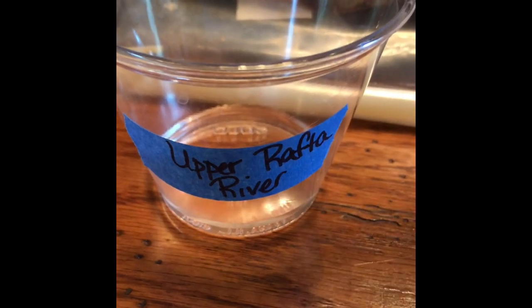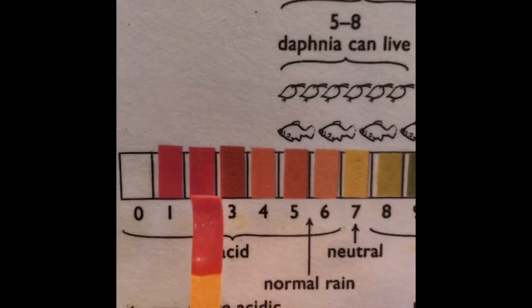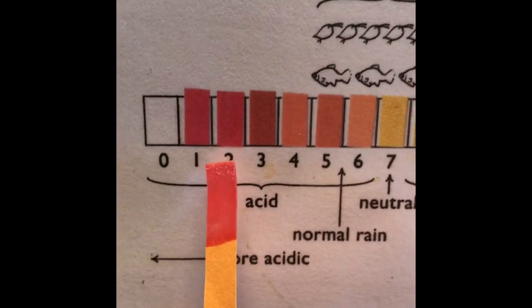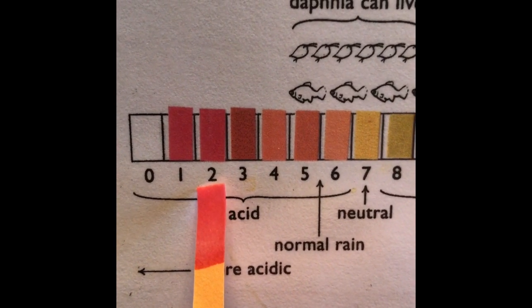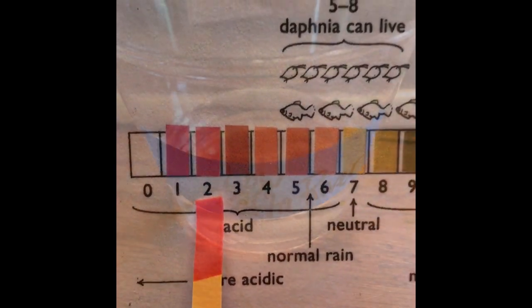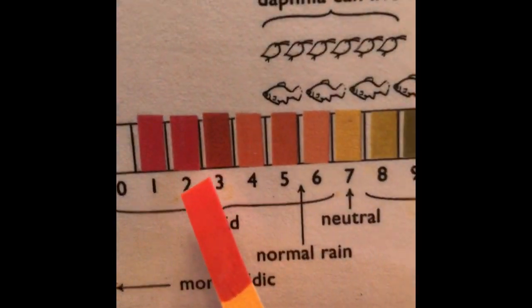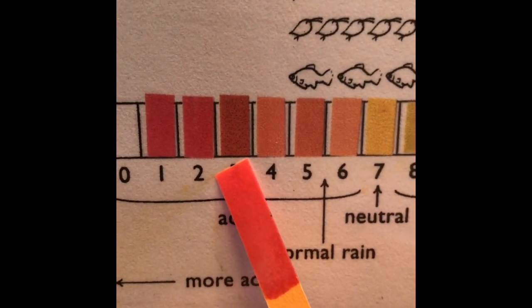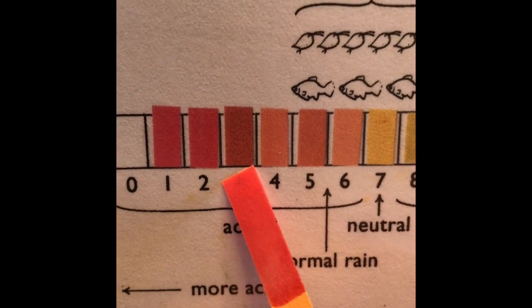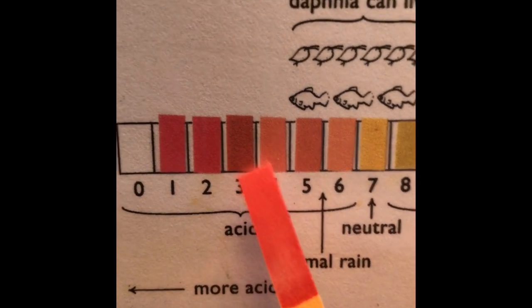Upper Rafta River has a pH of 2. So Upper Rafta River, pH 2. Low Rafta River has a pH, I'm going to say 3 for this one. Looks a little different on the screen, but it's a pH of 3. Low Rafta River, pH 3.